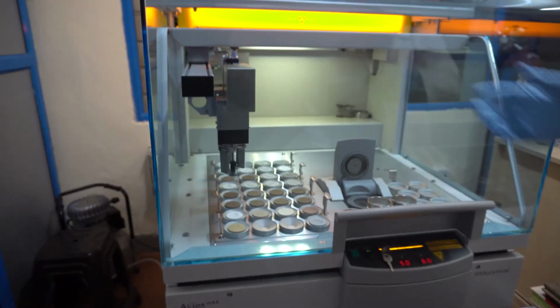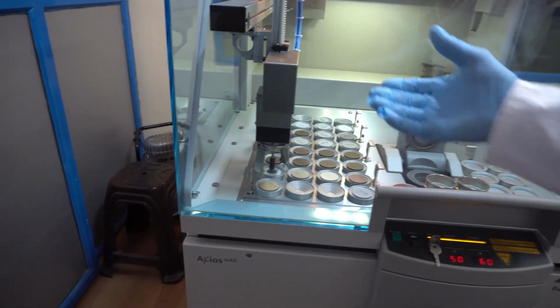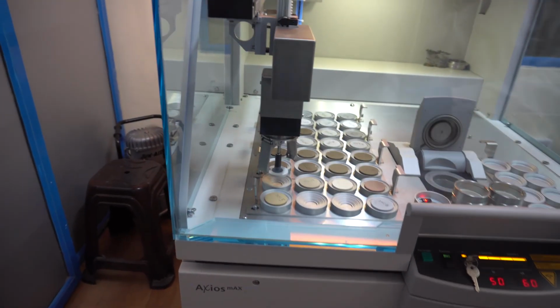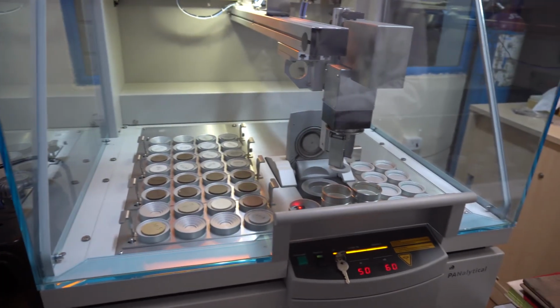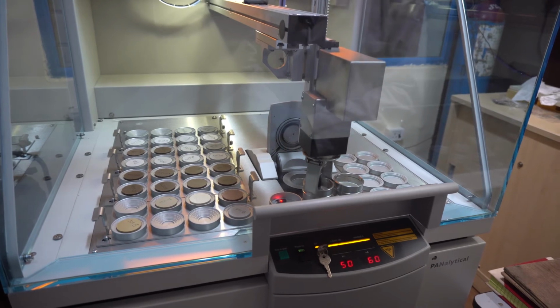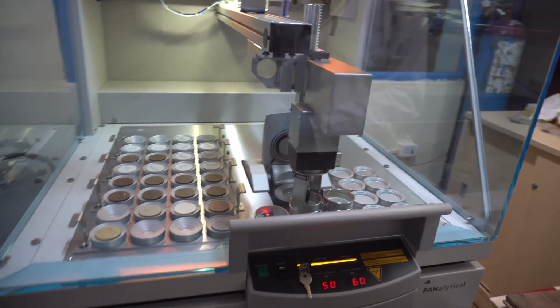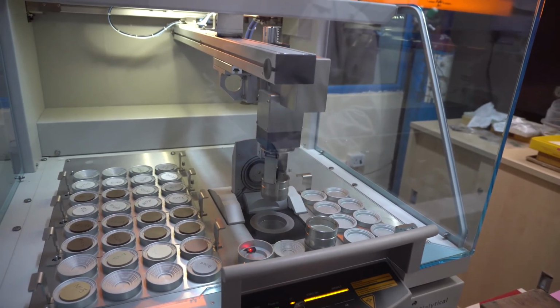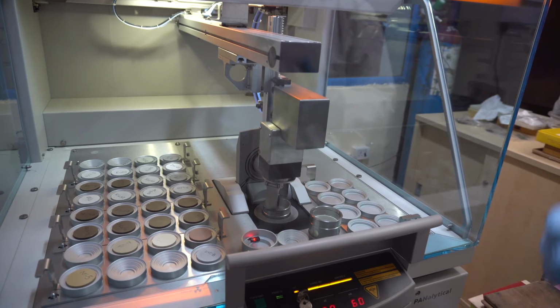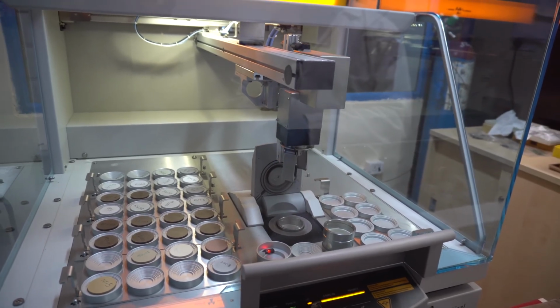See, the auto sampler will take the sample automatically. It will go inside the sample holder. Once the sample is put inside, the door will close automatically.